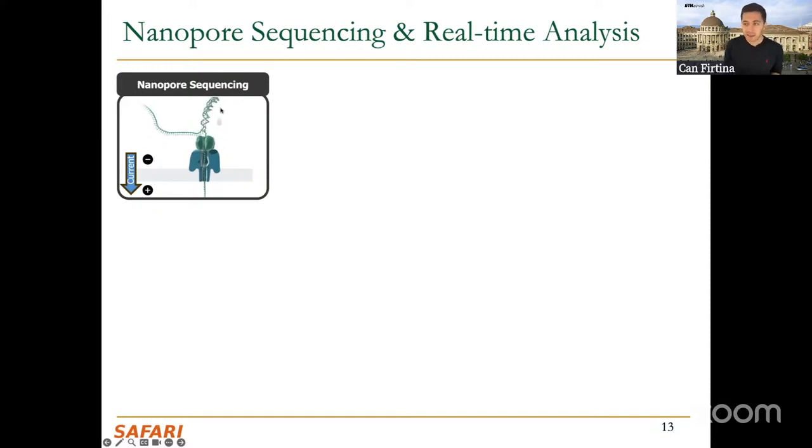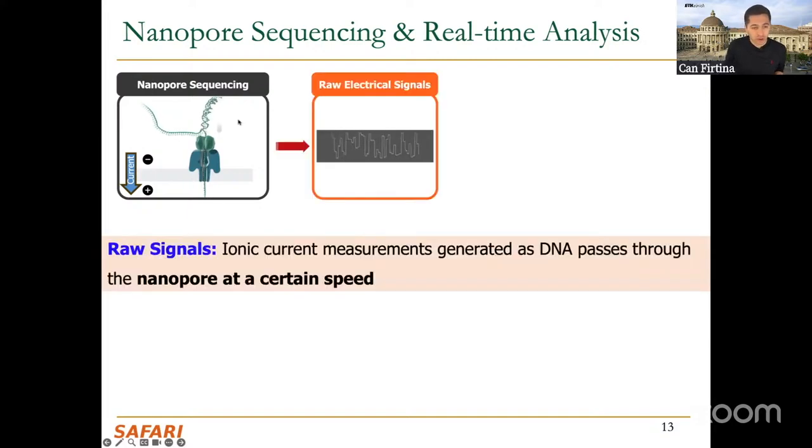Since the DNA is also negatively charged, once the DNA is attached to the pore, with the help of this motor protein, we start sequencing it. Usually, specifically for the DNA, you break the double strand structure of the DNA. So now you are essentially sequencing a single strand of the DNA. And as this single strand goes through this pore, the ionic current, the current that flows through this membrane, will be disrupted. These disruptions are informative for us to tell each base, as I told earlier.